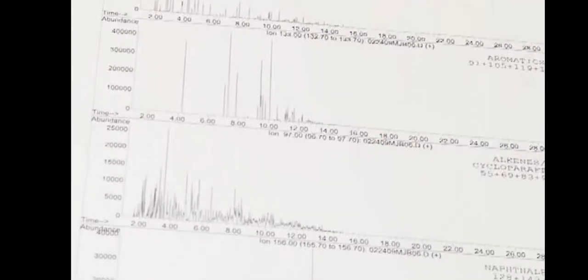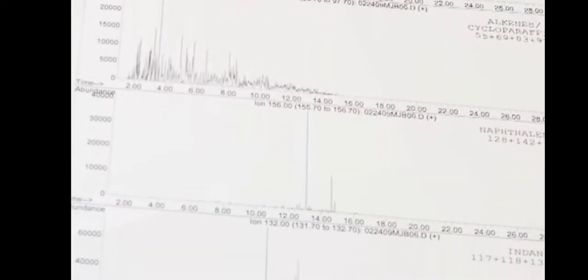At that point, it's a good idea to provide some sort of an example of what kind of products might be in that range. An example of a medium petroleum distillate would include something like your common paint thinner or a charcoal lighter fluid. There's also various different classes. There's light, there's medium, there's heavy, and there's also a lot of specialty products out there that typically we would put into one of those ranges, and then also provide an example of what that possible ignitable liquid residue is.